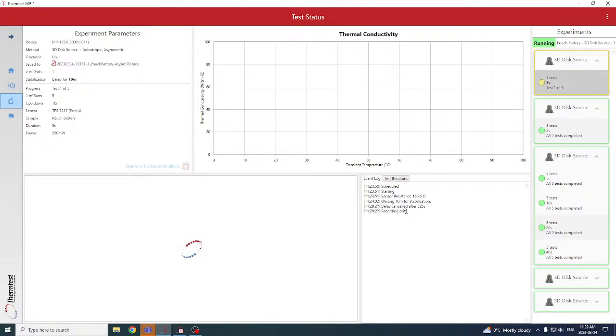In advance of every transient measurement, it does a 40-second drift. You can follow that in the event log. We can follow this along for a bit. That's 40 seconds, and then that timestamp will change with the transient measurement. We can see that progress through.